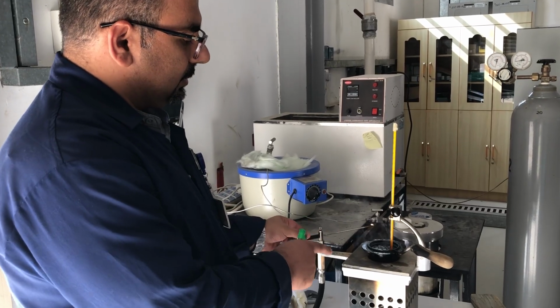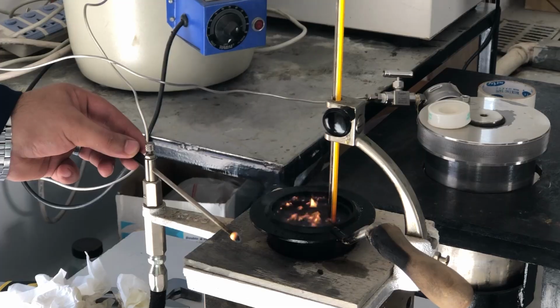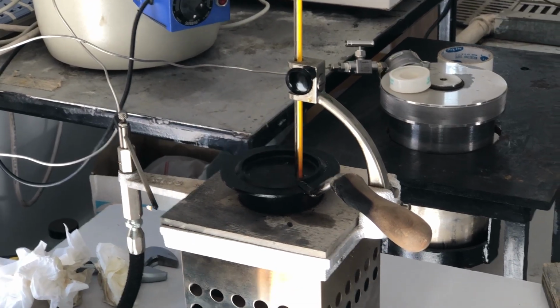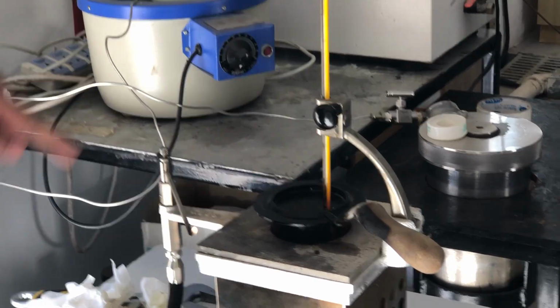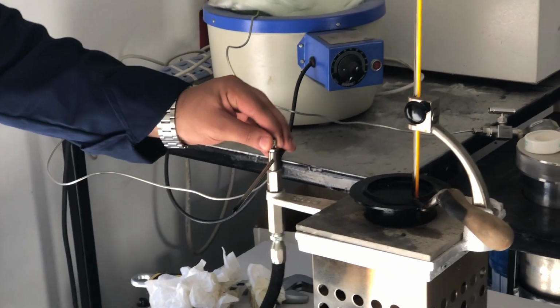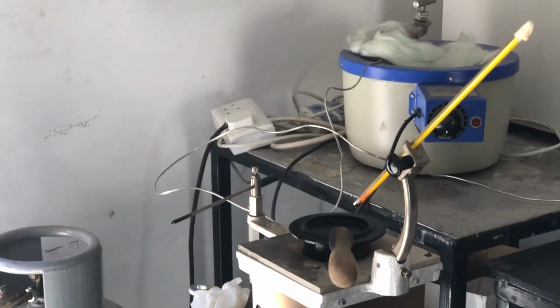Now it is firing. It starts to fire. You see the flash is staying for a longer time. It is the start of the fire. Now we can record the temperature. It is 320 and the fire is there. So 320 is the fire point temperature. Now we have to kill the fire.